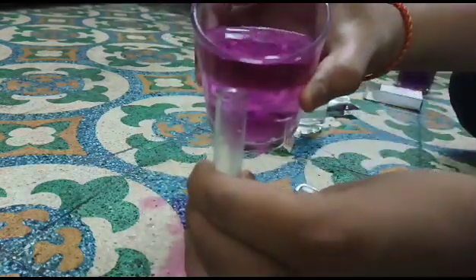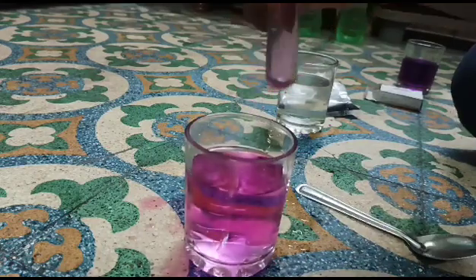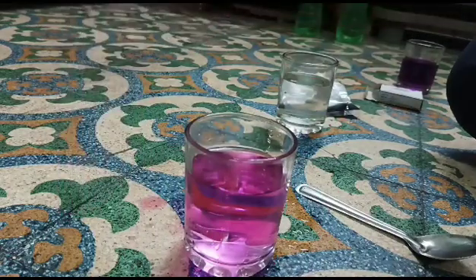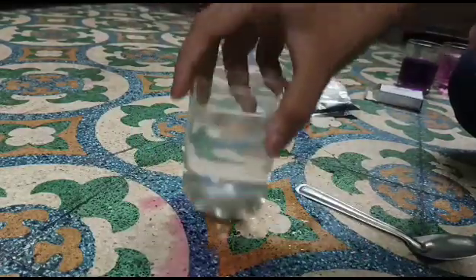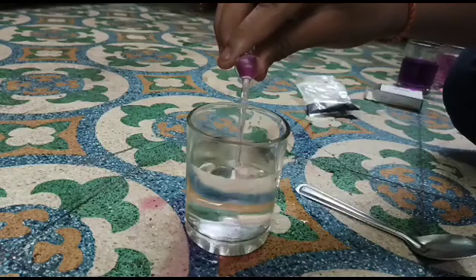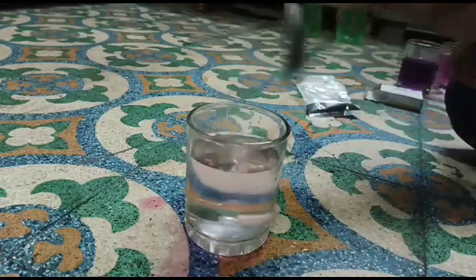Take the test tube again, fill it with water, sorry, 10 ml. Yes, it is estimatedly 10 ml. Now pour it into the third glass. Okay, now we will pour it into the third glass, and will it be the same as the second glass? No, because the quantity of matter is even less than in the second glass.